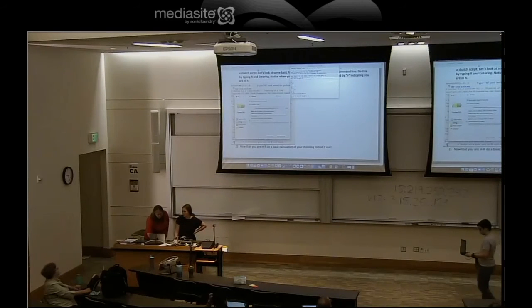A lot of today we'll be working through a script on the ShortRead website called the Learning R script. Be sure to download that. That is what we're going to be working on for most of today, and it is about learning R. You're going to use some of the preset data sets that are part of R to practice working with these data frames and practice doing these basic operators. The very beginning, I will show you.